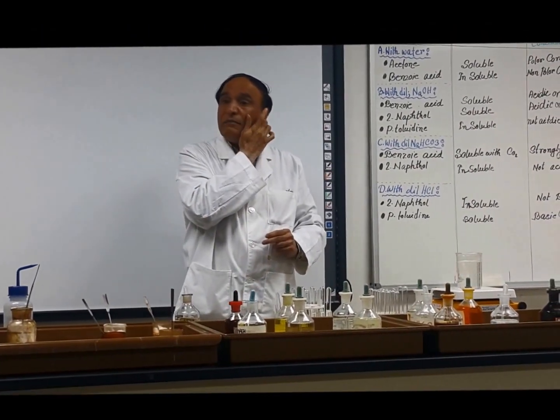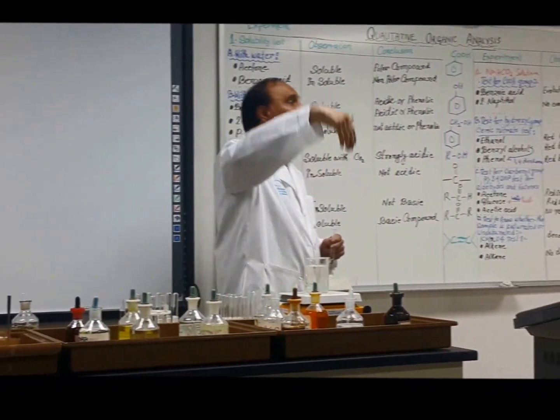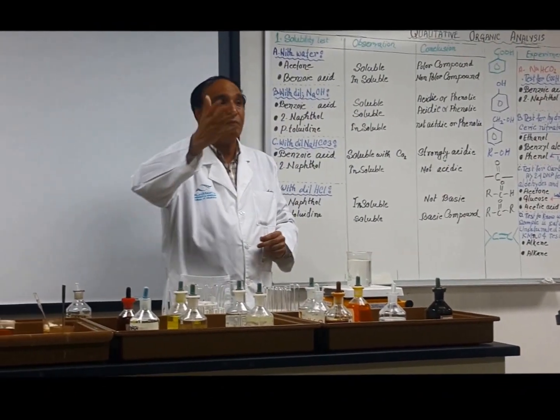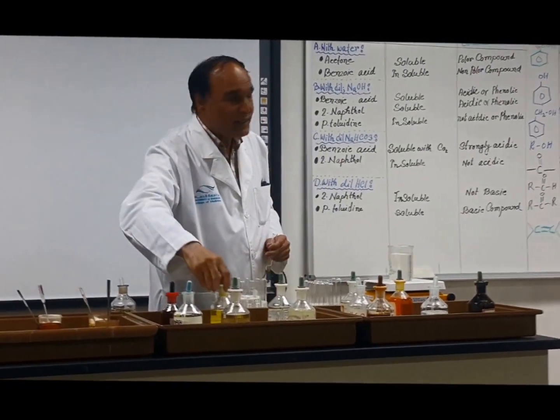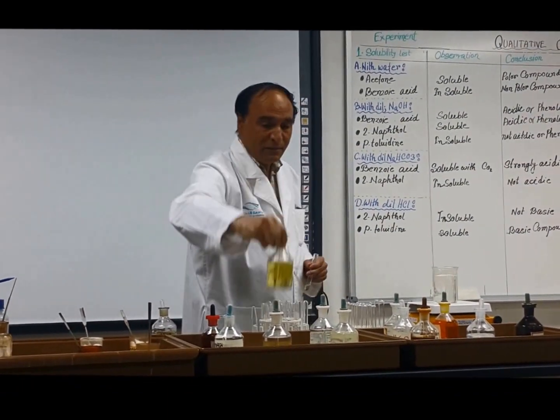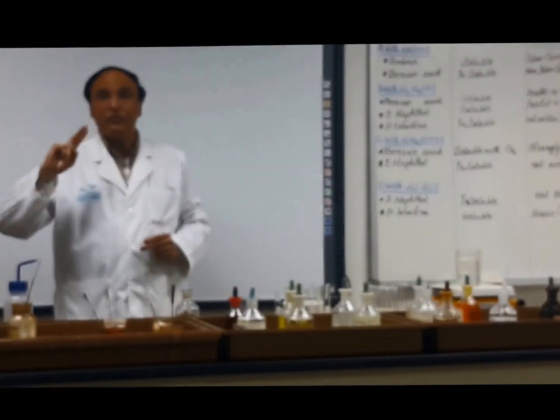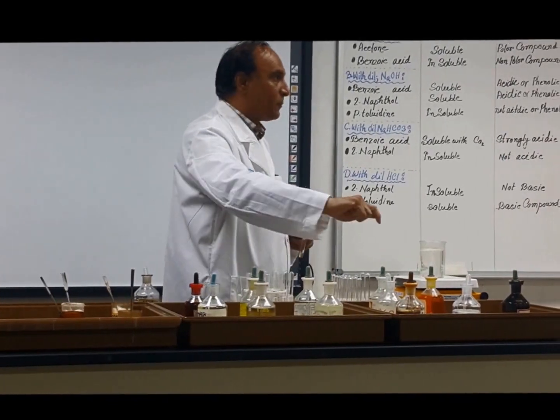Since many of you from this university will go to other universities and, inshallah, do research work, make sure when you take anything, first of all, you read carefully what you are taking. Read the label. Point number 1. Second point, I have already told you, which is the most important point, never exchange the dropper.